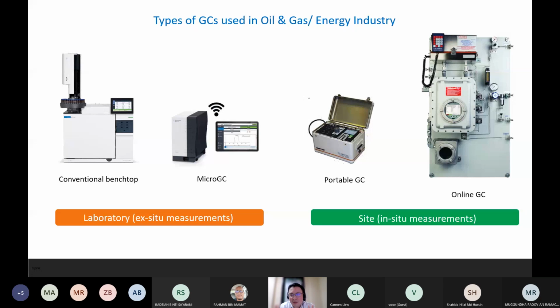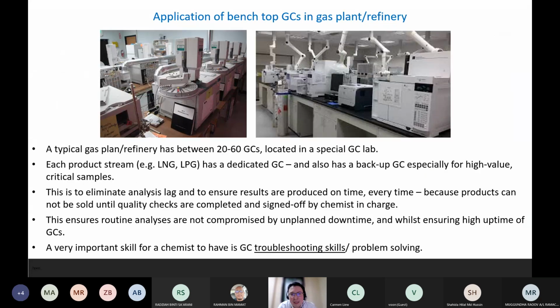And you can get the analysis done. But nowadays things are very sophisticated, very canggih. Back in the day, we used to plug micro GCs in using the RS232 port. Then they went to the RJ45 port, which is the LAN port. Now wireless technology kicks in, and you can hook it onto your iPad. They have apps for that, so you could be running an analysis in the lab while sitting at your desk looking at your iPad and getting real-time data. That's fantastic.